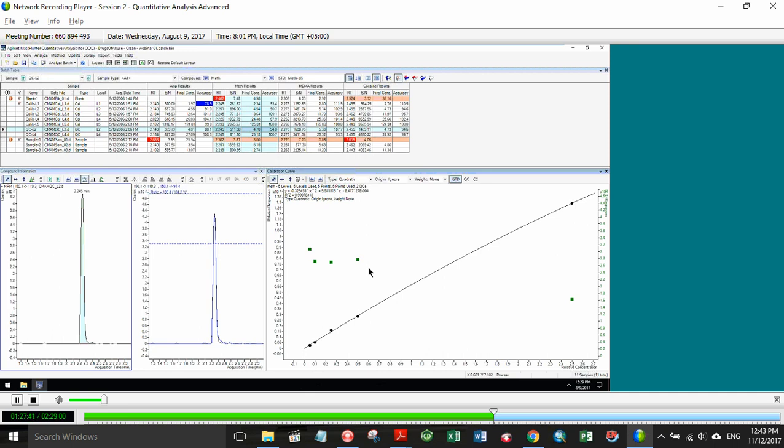Okay. And if this person would like further clarification, just drop us another question. We'll certainly get to that one shortly. Another question here. Let's save that one also as one to look into for us, Lindsay, okay? Sure. We'll research that one a little bit more.